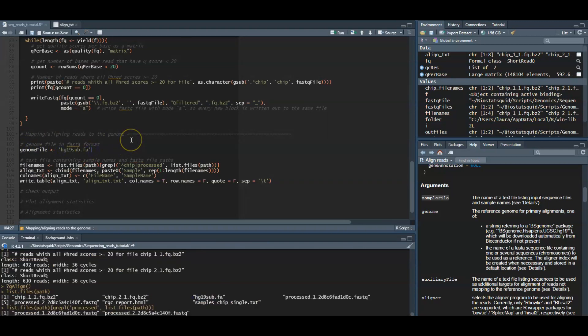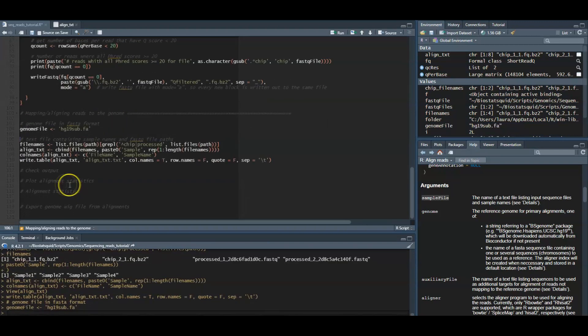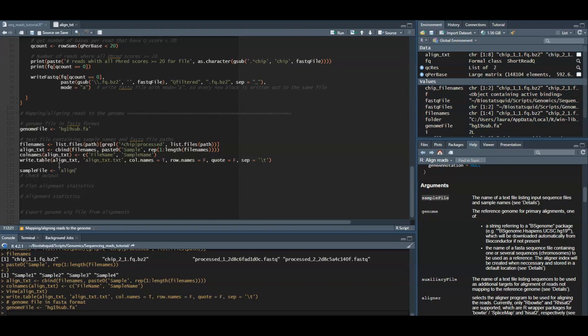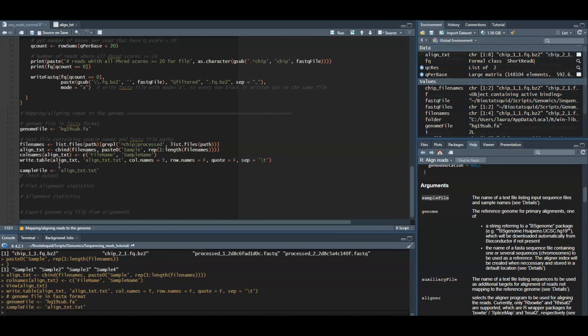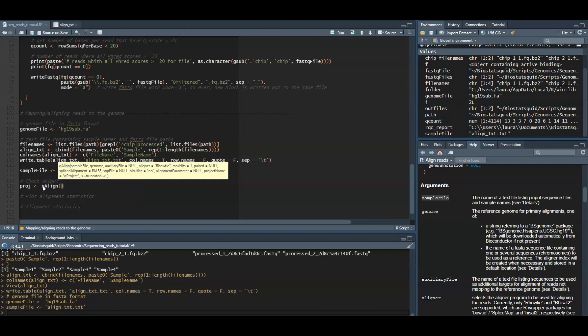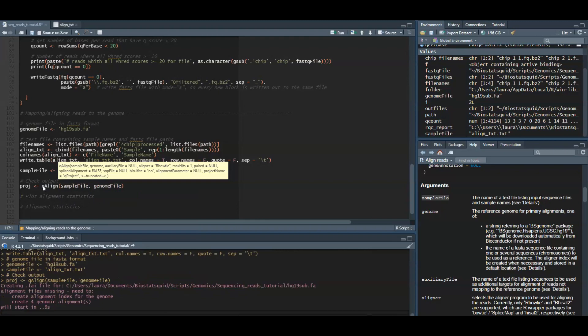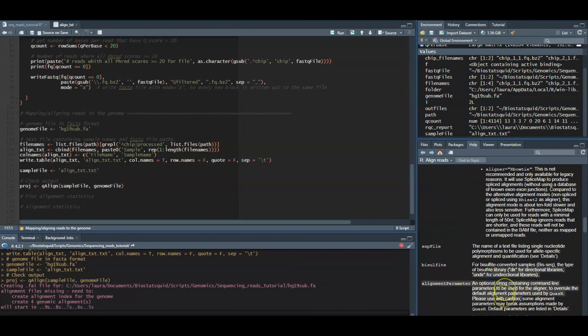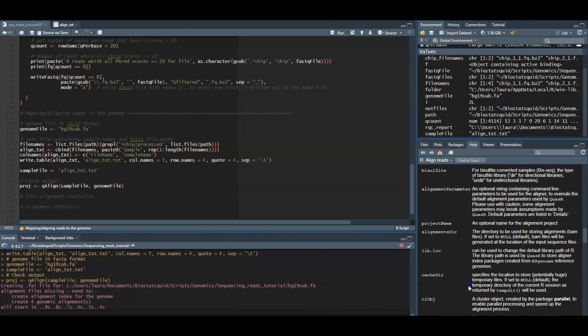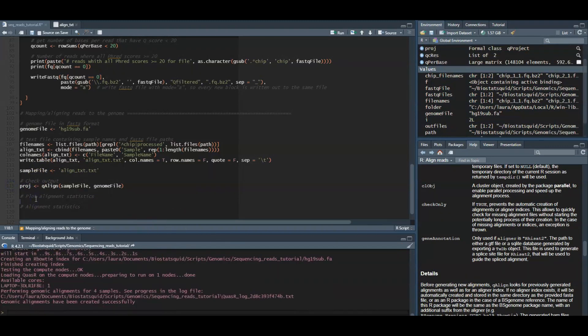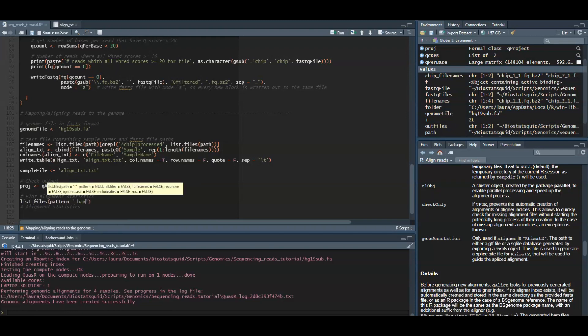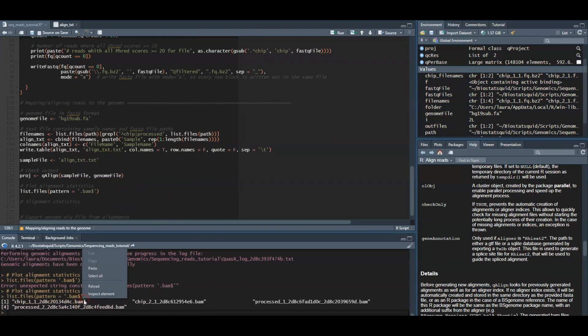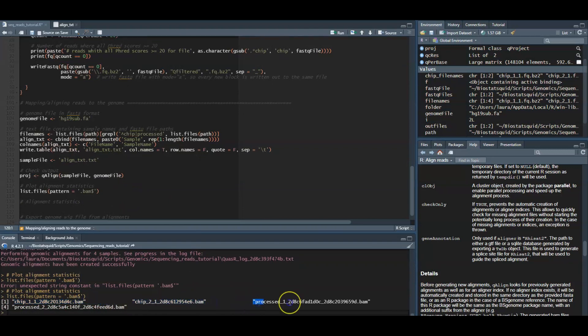So now we can just use the qalign function to align our filtered reads to the genome. You can read more about other arguments it takes, which can be optimized for different alignment problems. For example, if you're working with bisulfite sequencing, so DNA methylation data and so on, it might need some extra steps. But this qalign function will basically do a bit of magic. And our results are stored in this project object.